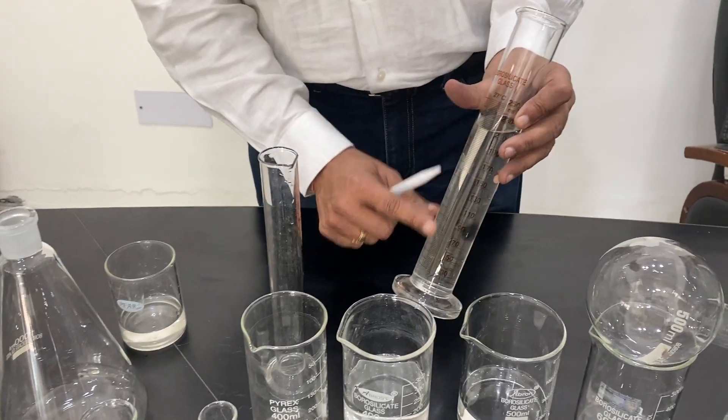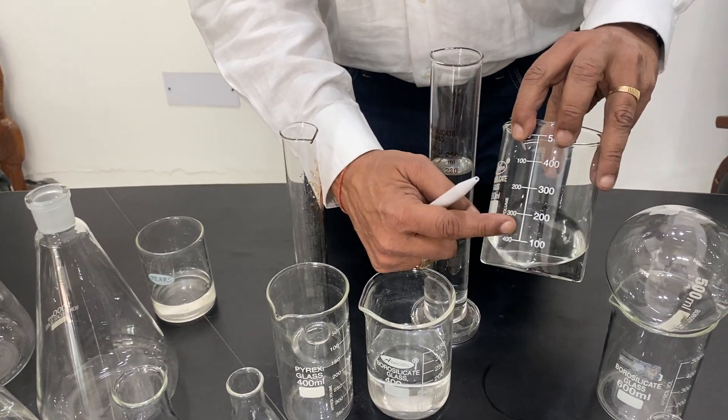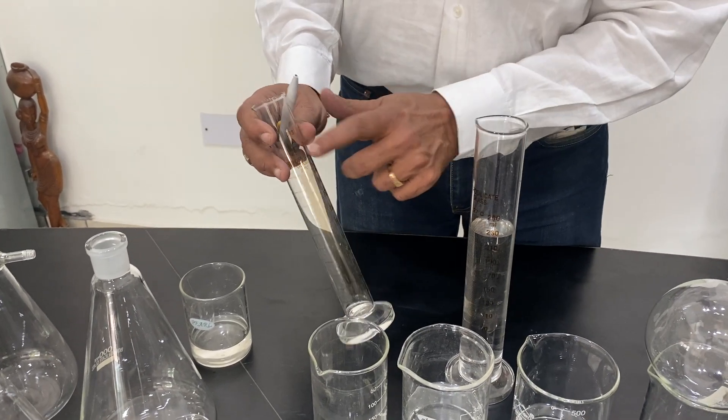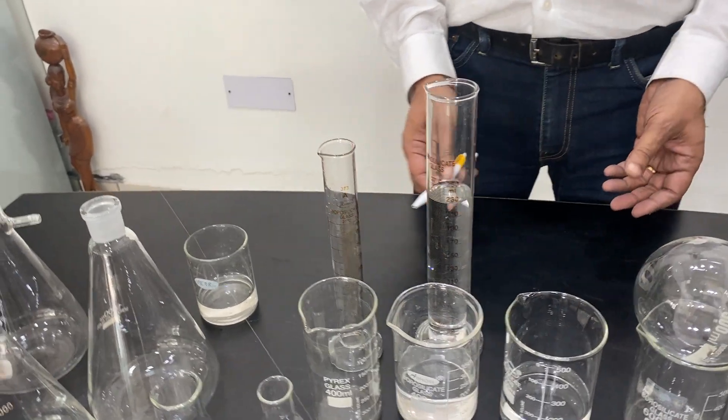Measuring cylinders come with amber graduation or white graduation. Amber-colored beakers and cylinders, which are almost brown, are also available for photosensitive chemicals that are sensitive to light.